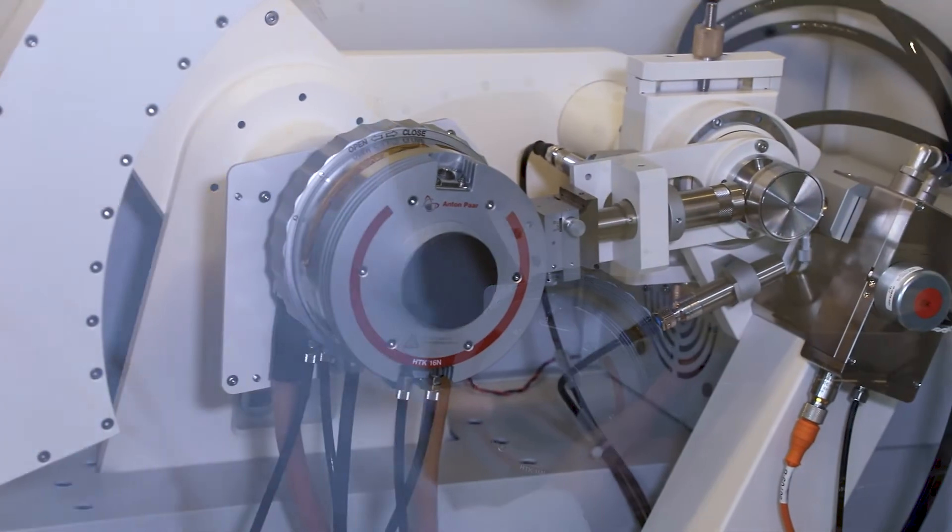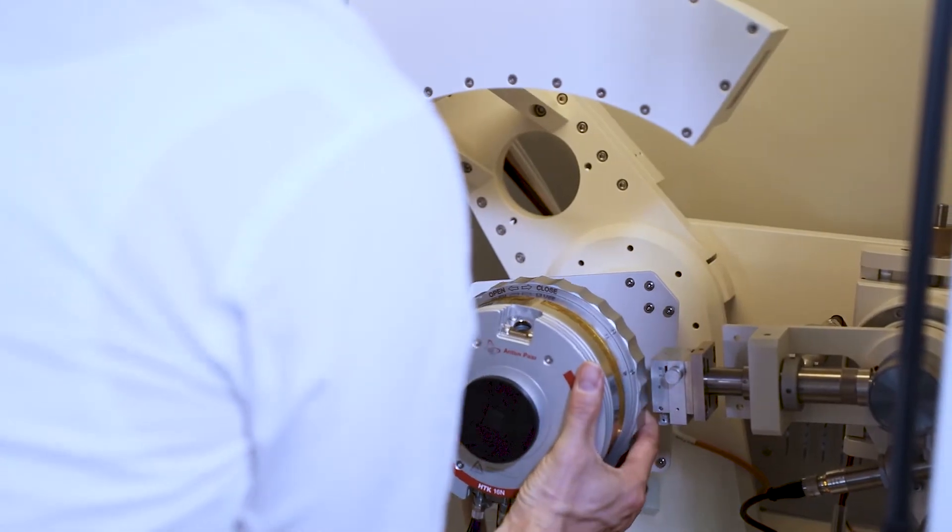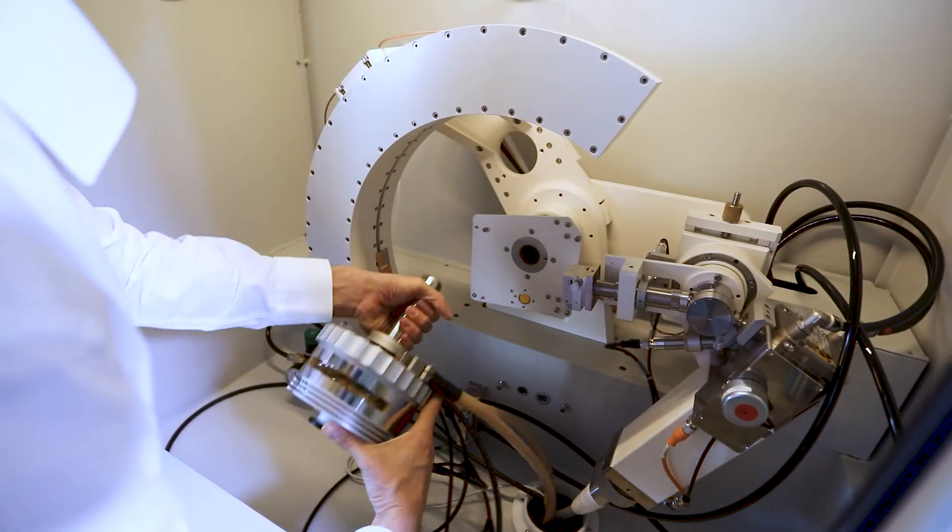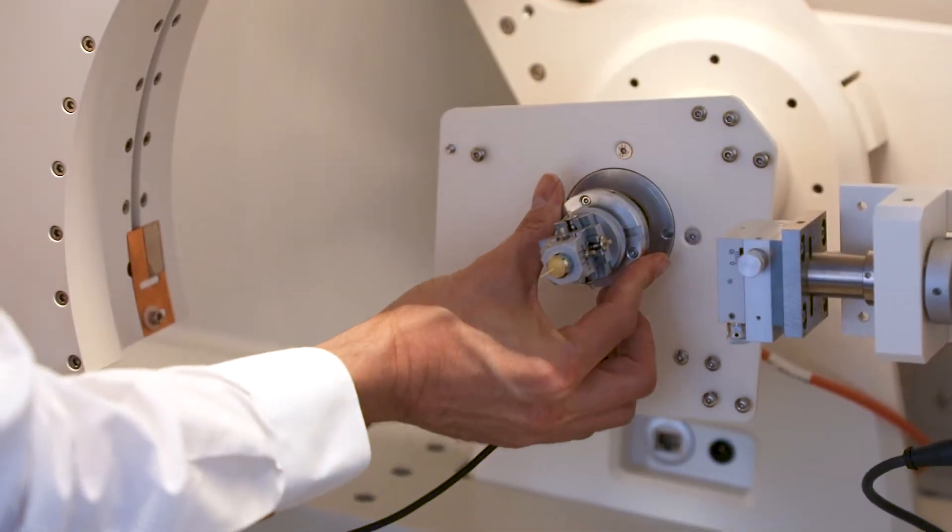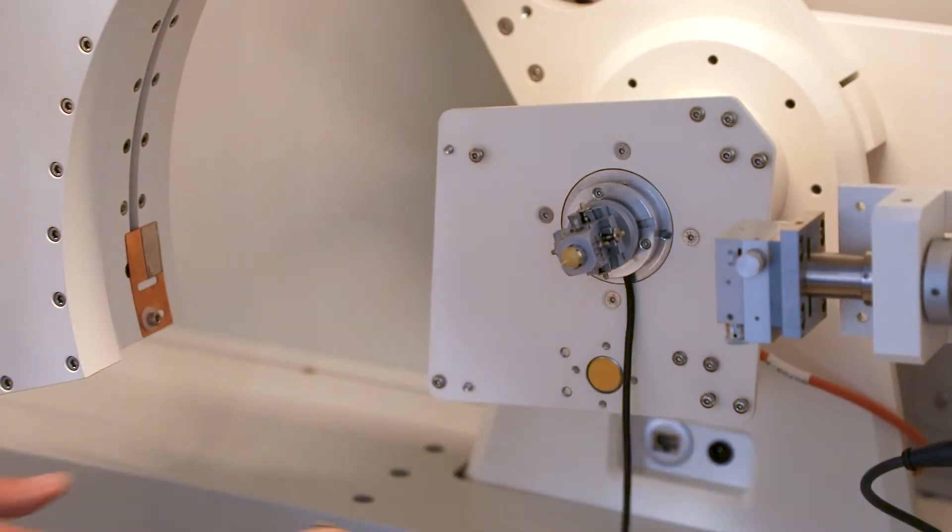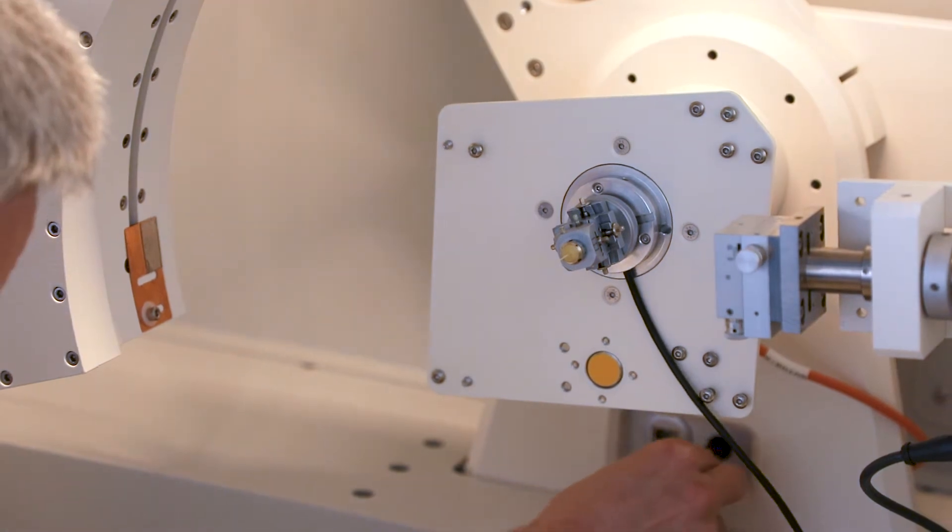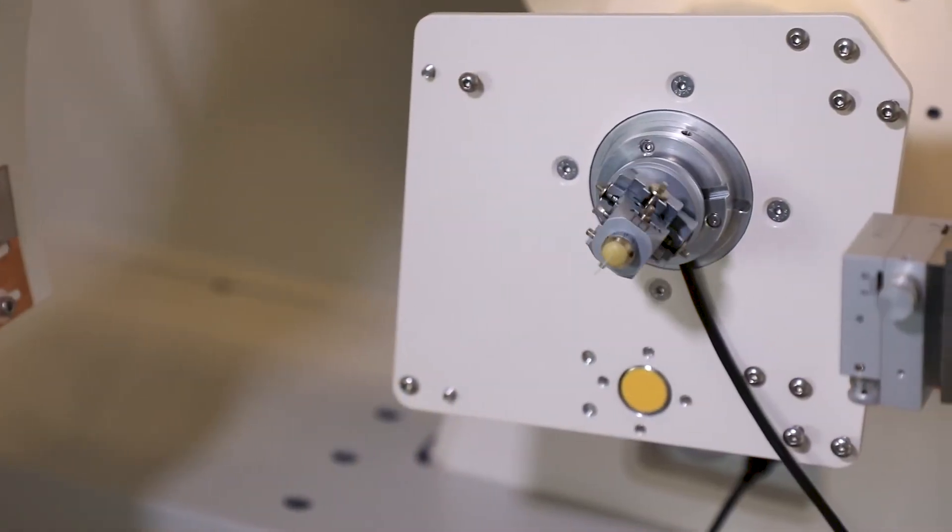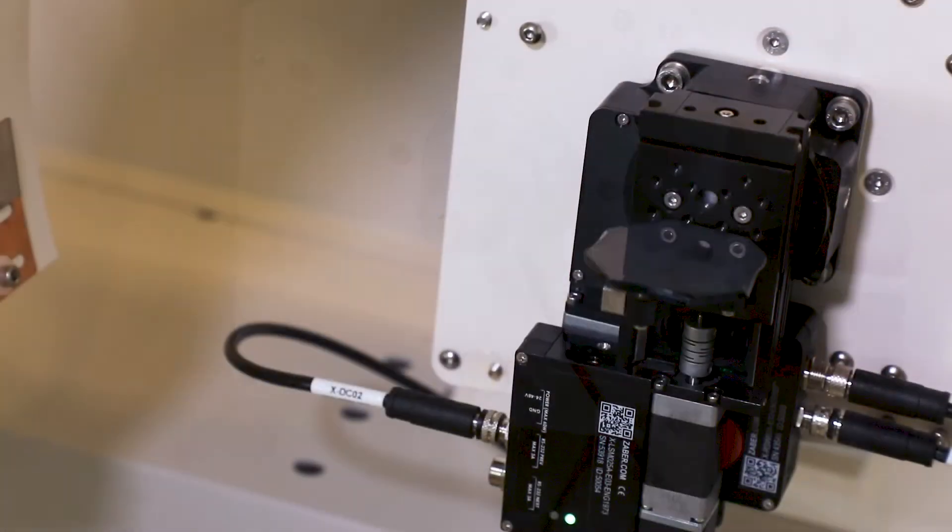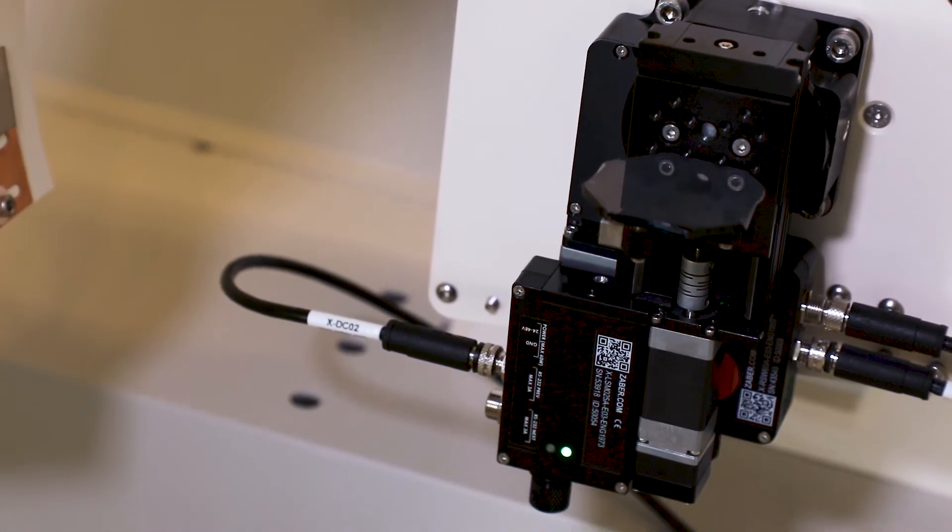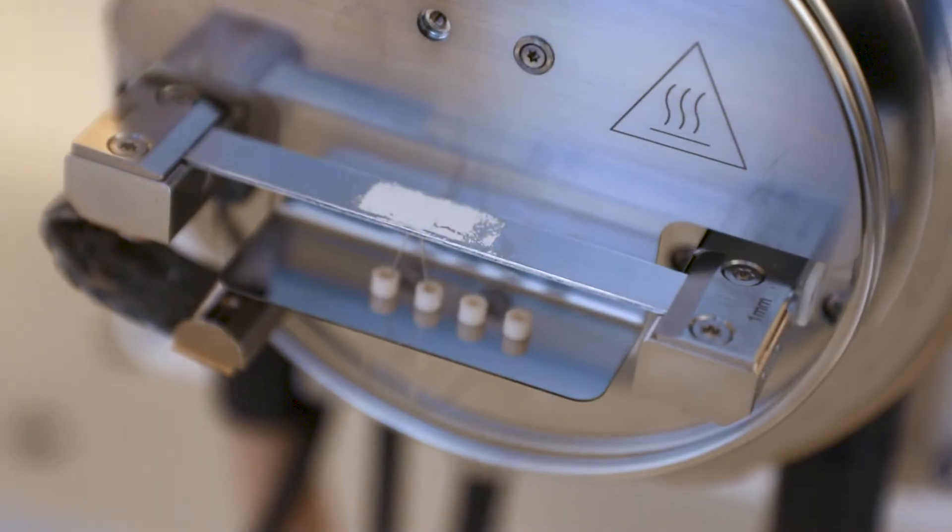The ARL Equinox 3000 and ARL Equinox 3500 are versatile instruments which can handle several sample types under various analytical conditions. There is a large sample space to easily accommodate a wide range of accessory stages, including controlled atmosphere, capillary transmission, GIXRD thin layer analysis, and a 30-position automatic sample changer.